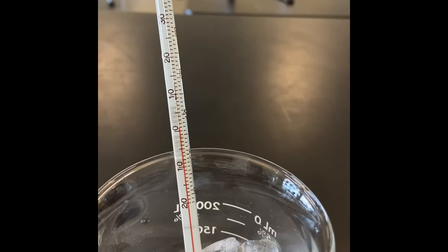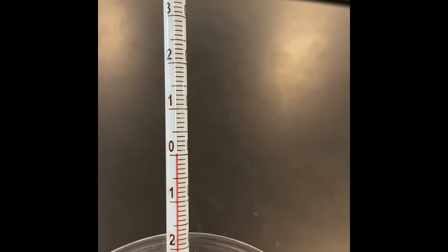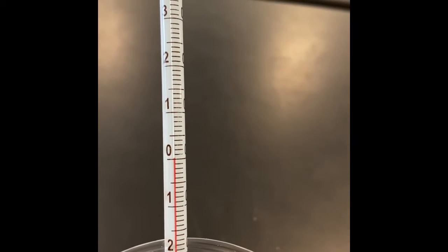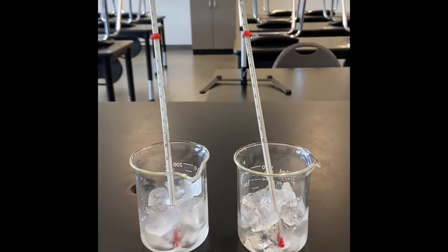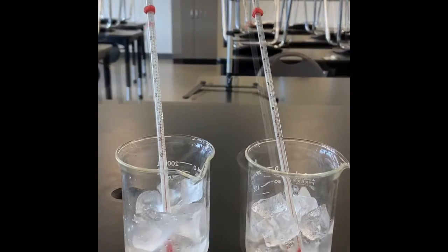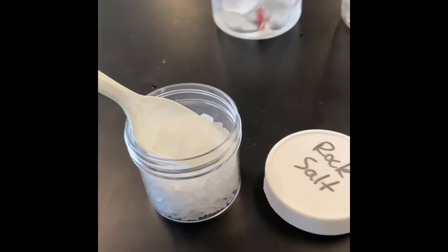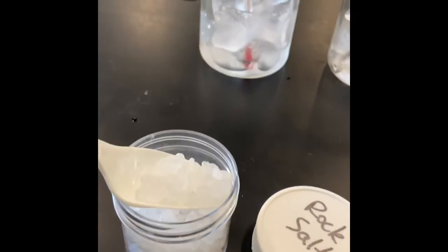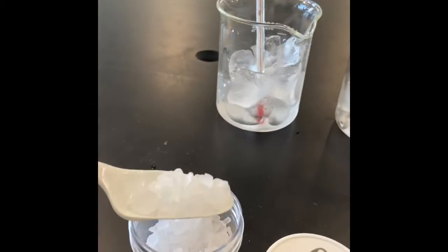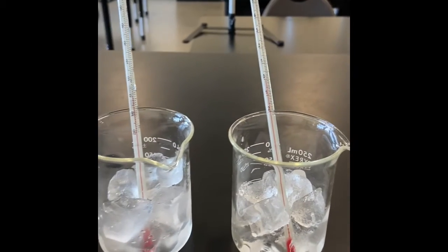This one looks to be about 0 to 1 degree Celsius. And we see the same thing here, maybe just slightly above 0 degrees Celsius. Does that fit what you already knew about the freezing point of water? Here's where we're going to introduce a mixture into this problem. I have here some rock salt. It's just some chunky salt, and I'm going to add it to one of these 2 beakers.